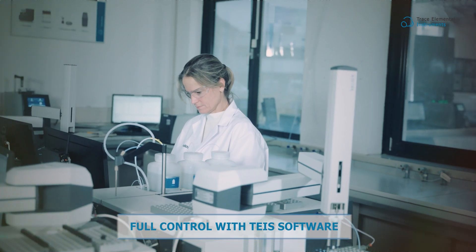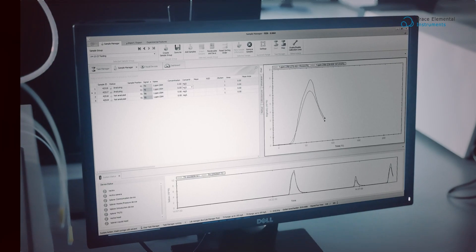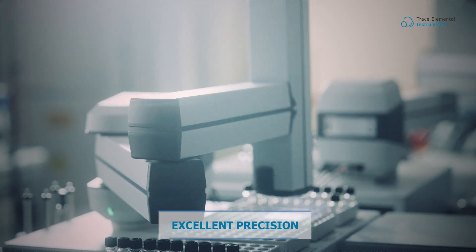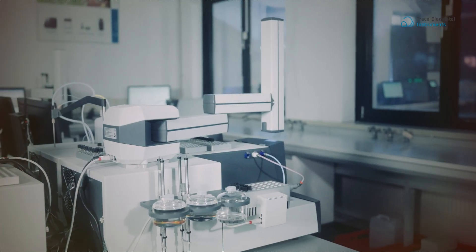Take full control of the autosampler with TEIS software, offering seamless customization to meet your unique method requirements. Angular rotation movements provide a large work area to accommodate your experimentation requirements.